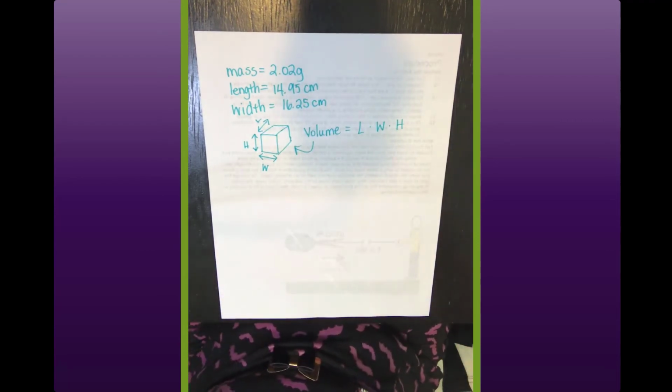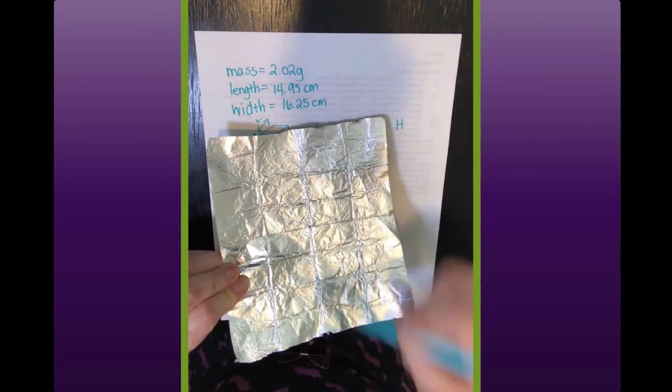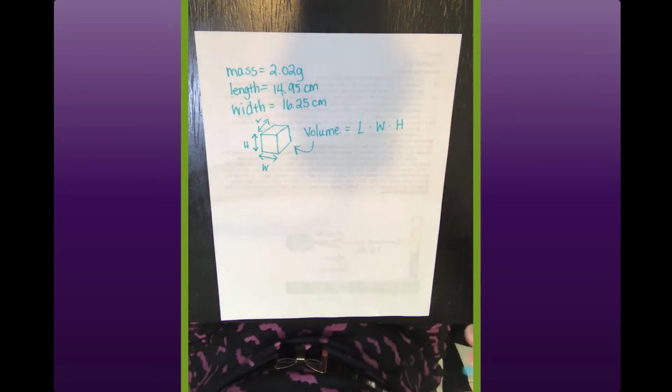Okay, so once again, our aluminum foil, we have the dimensions in this direction, and we're trying to figure out how thick it is.